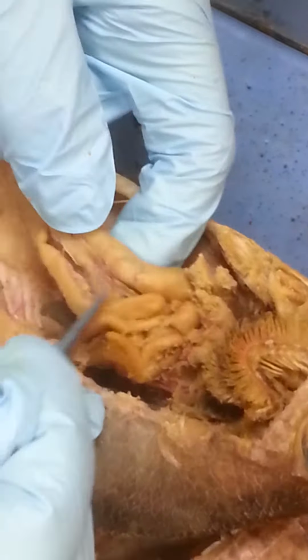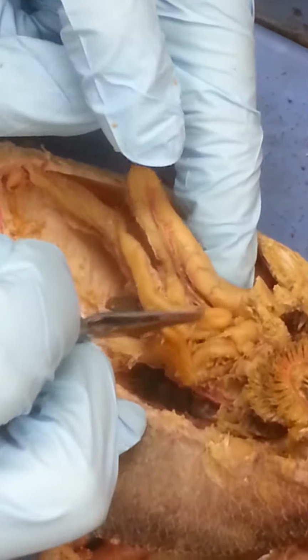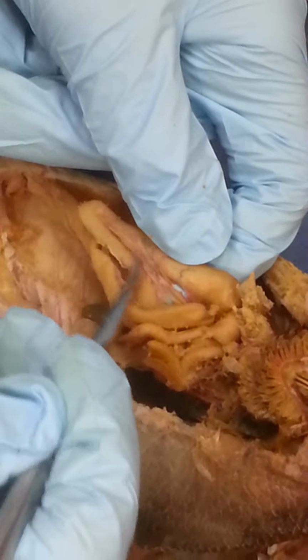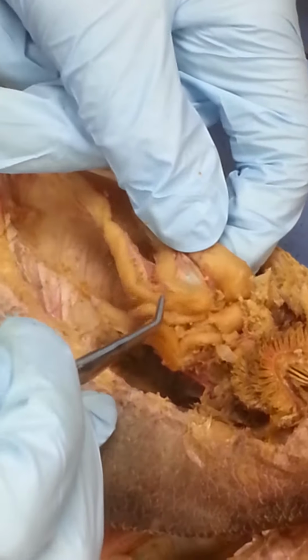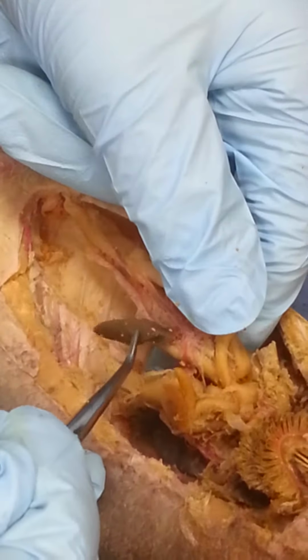This first loop is the duodenum, very distinct loop. And inside the duodenum is this thin little thing right here, and that's your pancreas, and that's kind of in this mesentery of the duodenum. It's called all that kind of connective tissue. Then the rest is just the intestine, and then you have your spleen.